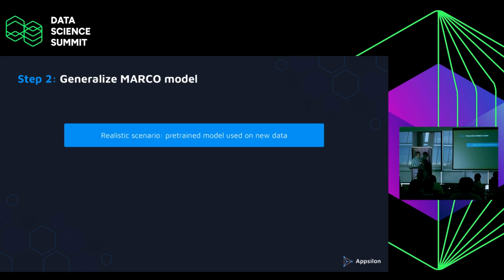Okay, so that is all fine, but it's still not really a very realistic scenario, right? In a realistic scenario, it's not that you have a data set on which you want to measure your performance. You actually want to use a model in your own lab, or, for example, you're working on a project for someone and they want to use your model on their data. And the question is, what happens if the model is actually meh, like we've seen the state of the art is on some type of new data? On some it's decent, and on some it's quite poor.